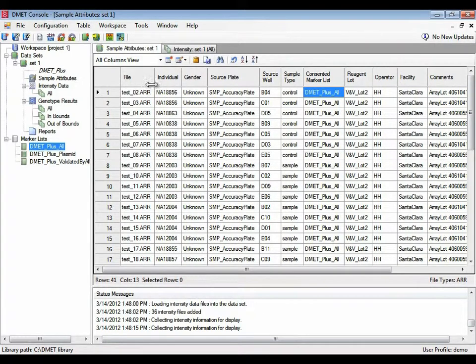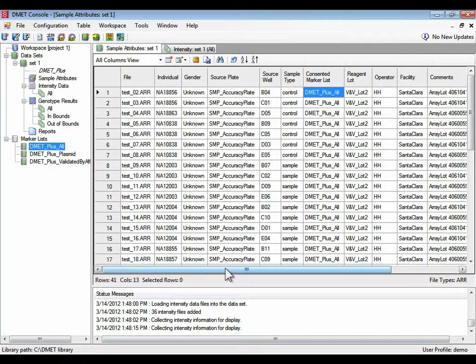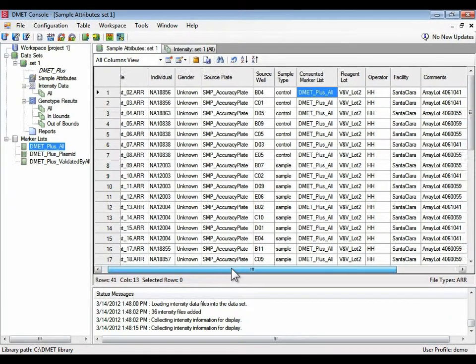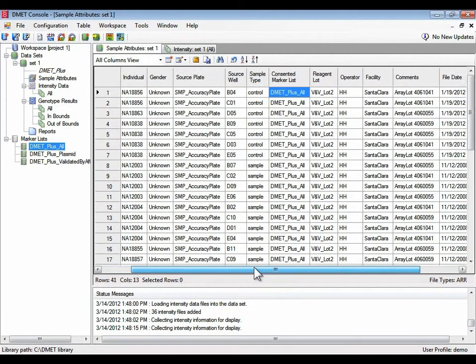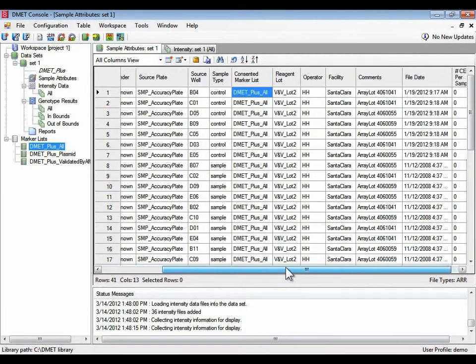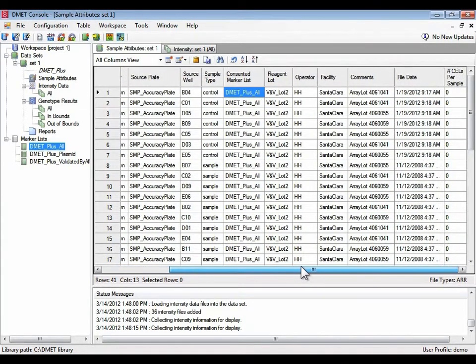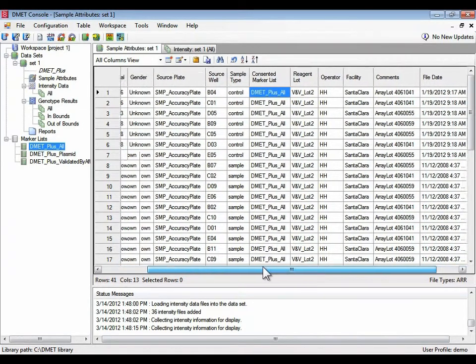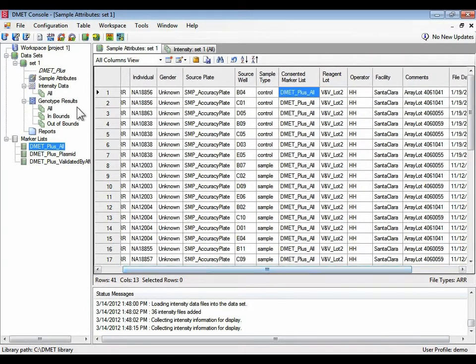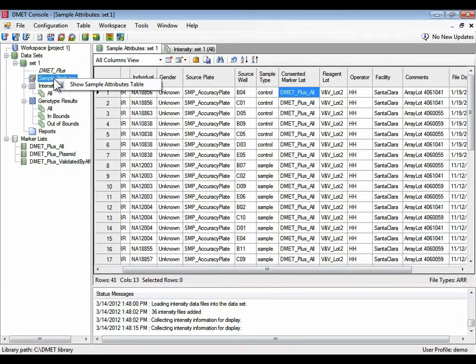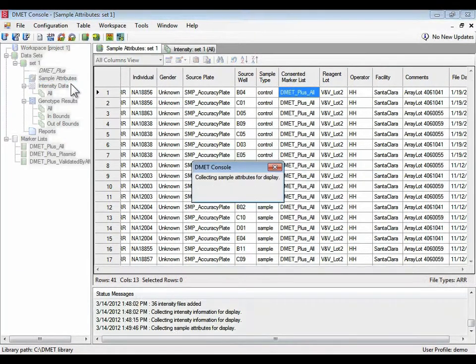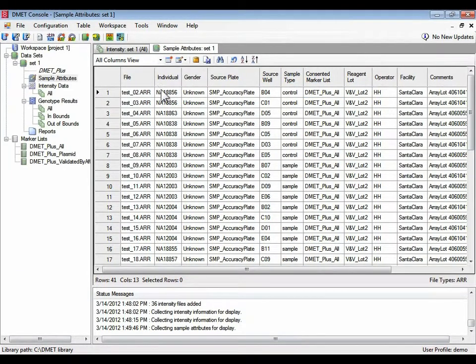Going back to the sample attributes tab, it doesn't just have information about what the contents of the file, but also tells you information about...let me just reload this. Let me refresh this information that the cell files have been added.